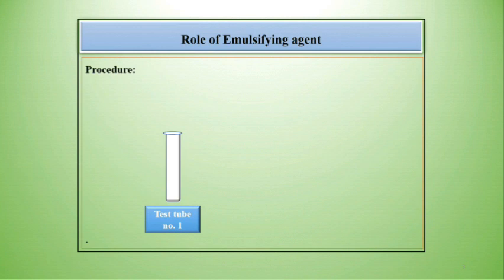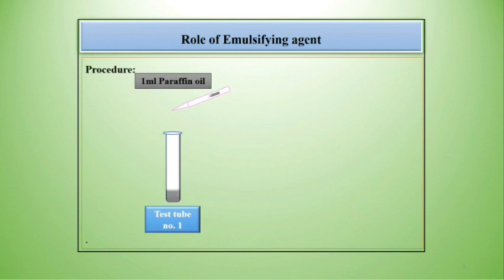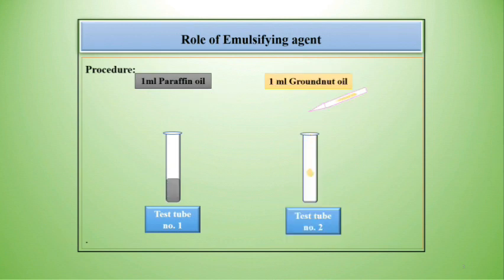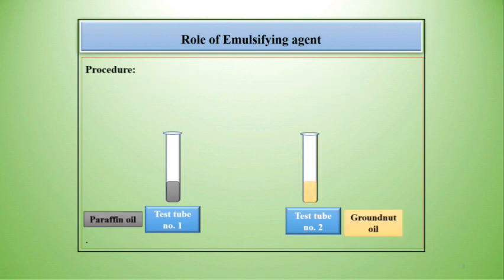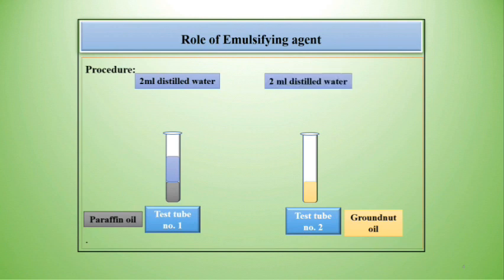Procedure: Take test tube number 1 and add 1 ml paraffin oil in it. Then take test tube number 2 and add 1 ml ground nut oil in it. Now add 2 ml distilled water in test tube number 1, and similarly add 2 ml distilled water in test tube number 2.